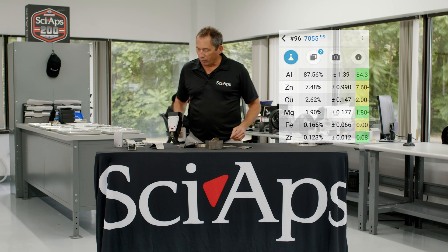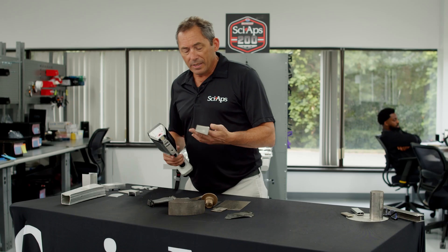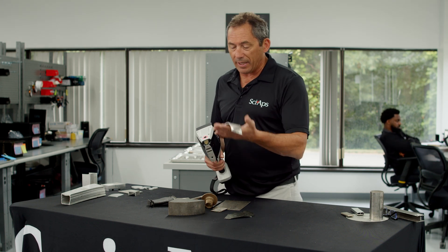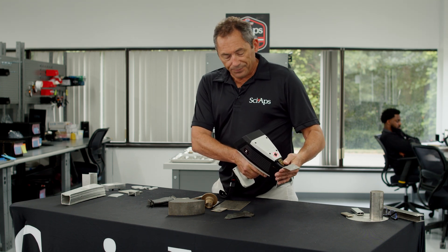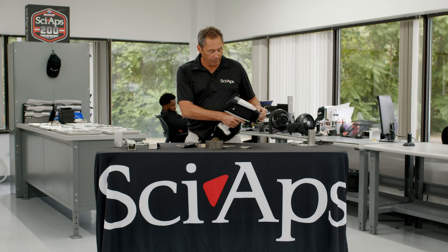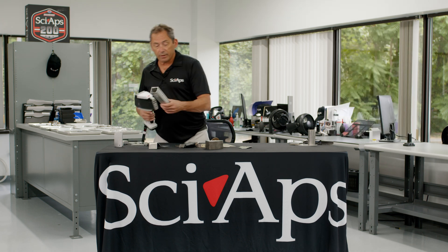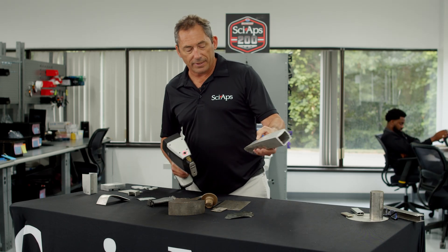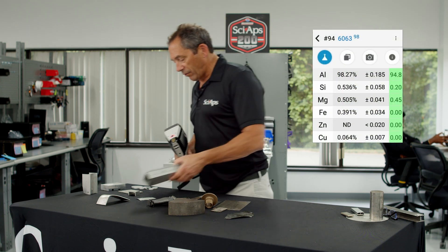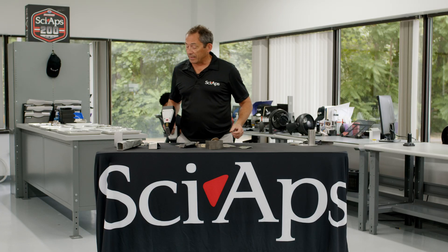Now let's go to the real world, because that's really what people test — they don't sit around and test standards all day long. So let's take some real aluminum. You can see it's probably got an anodizing coating. This is unground, as is — it's a little dirty — and there's your 5052, almost a perfect match. Let's go to this thin little piece; I think this is a 1100. Yeah, there's your 1100. There are ground spots but I'm not testing those — I'm testing where it's anodized. This should be a 6063. See how quick that is? 6063 and 1100 get mixed up a lot, especially by some of the older XRFs, because you've got to be able to see the magnesium quickly to separate those two. And you don't need to grind it.